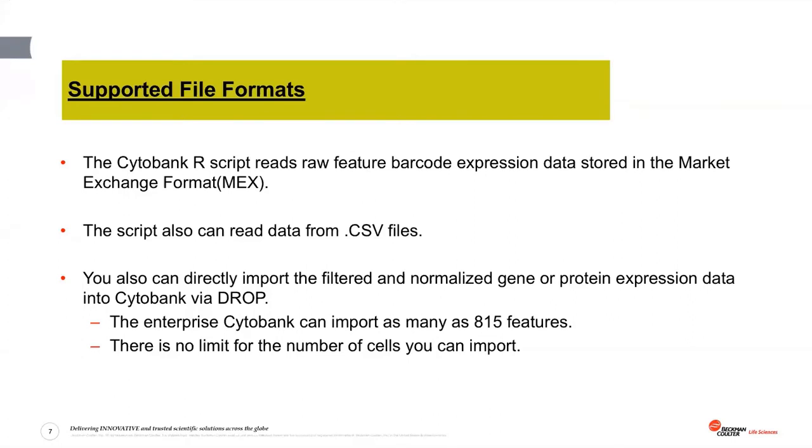One thing you can do is, in step 2, you can add one more step, which is running PCA, principal component analysis, to reduce the dimension of your gene expression matrix into a lower dimension. So for example, your raw data has maybe 5,000 high quality genes, and then you can run PCA to create meta genes, which will contain a combination of gene expressions from those 5,000 input genes.